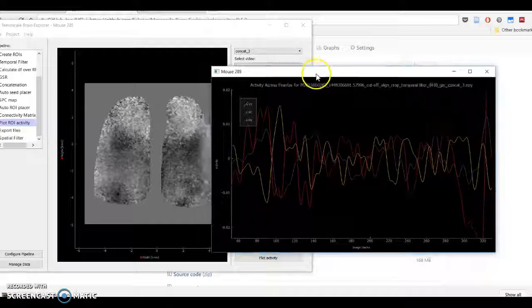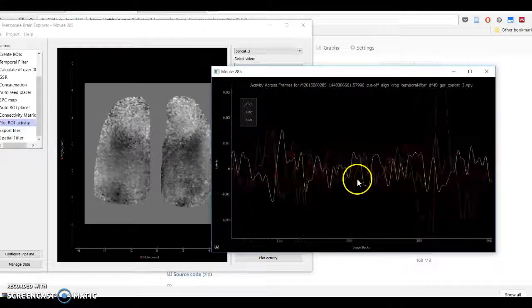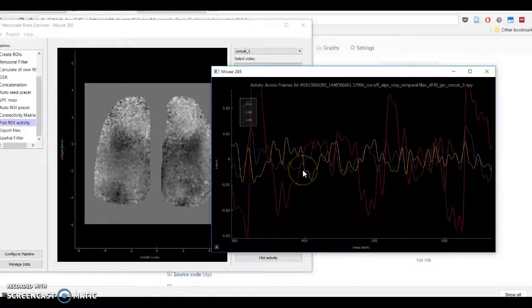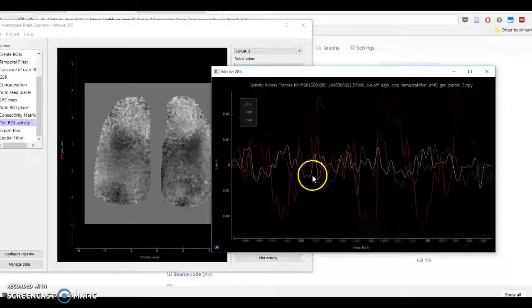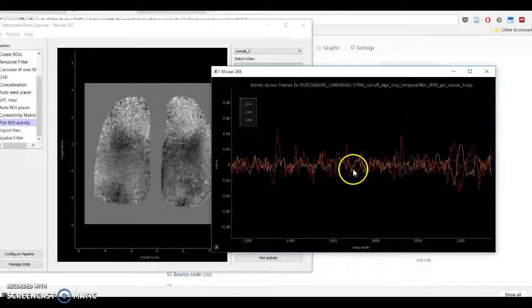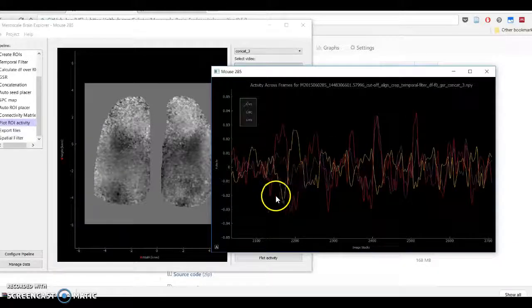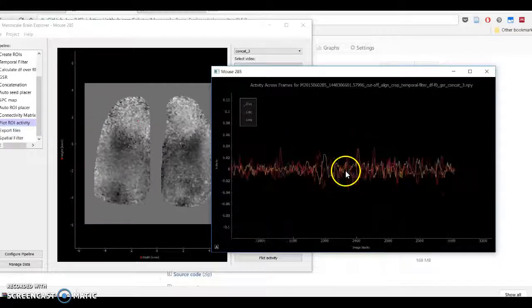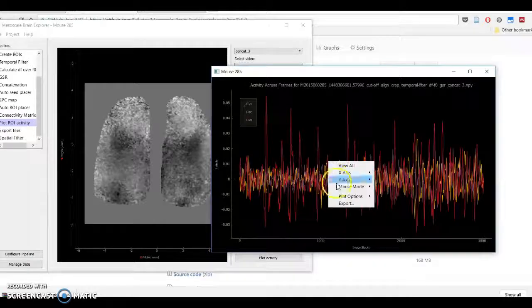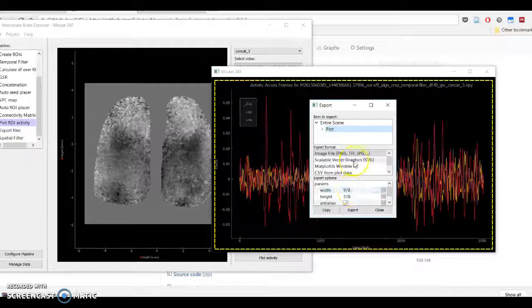And as you should be able to see, at least partially, there is a little bit of asynchronous activity between V1 here, BC, and M1. Obviously not the best, as this was a bit of a botched tutorial. But you would see that in, okay, over here we see it much, much better. Okay, so this can of course also then be exported. Oh, there's also the view all, which allows you to just immediately center on that. So this can be exported.